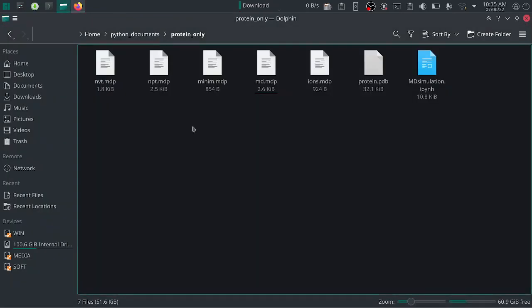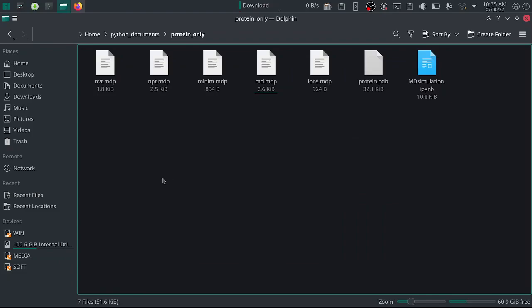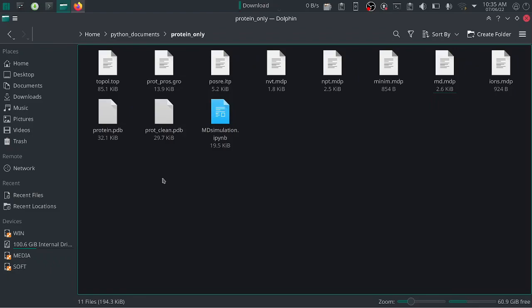Now refresh the folder to see the generated files. You can see the topol.top file, protein_clean.pdb file, protein_processed.gro file, and the ITP file.